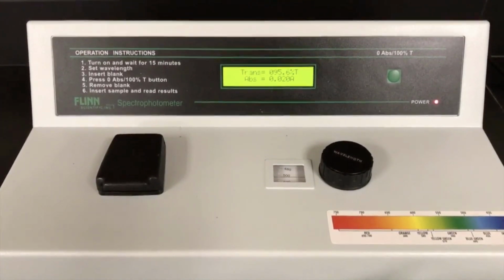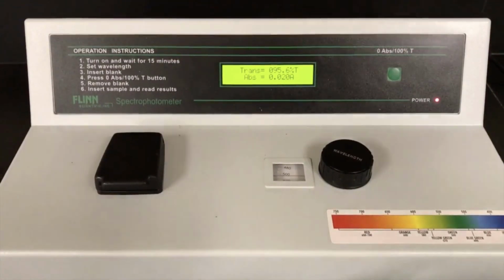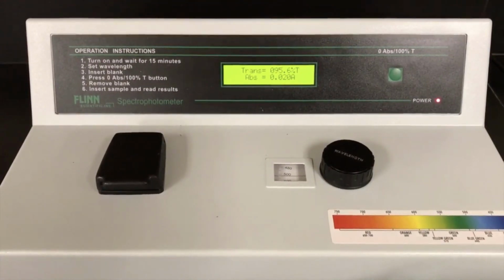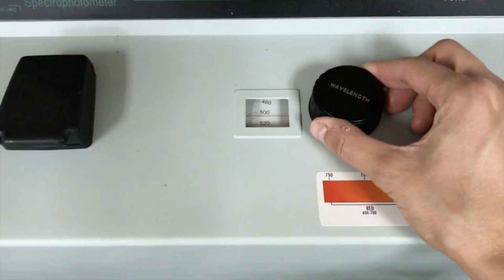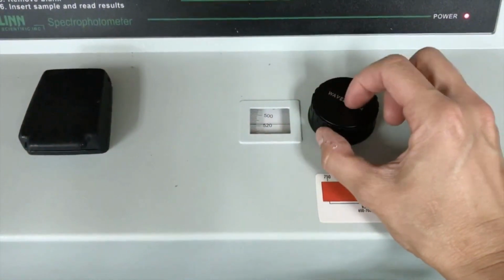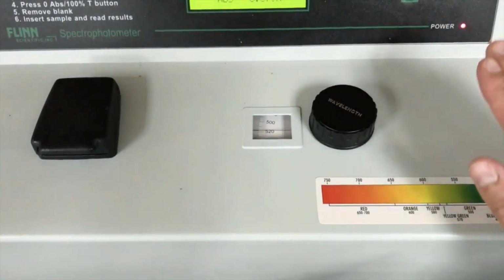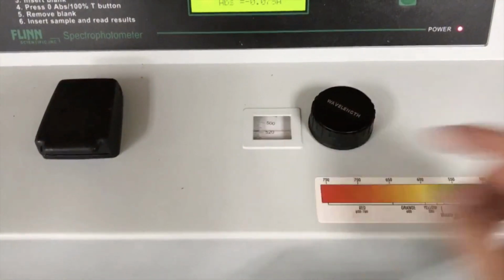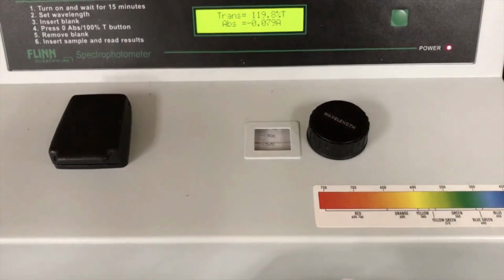Now, one thing that I didn't mention, before you use your spectrophotometer at all, one of the instructions in your pre-lab was to determine the proper wavelength. So if you notice right here, this says wavelength, you can adjust to the correct wavelength, whatever you decide. Once you adjust it at the very beginning, before I did any of what I just did, you need to have that set, and then you're going to leave it alone. You're not going to use that anymore, all right?